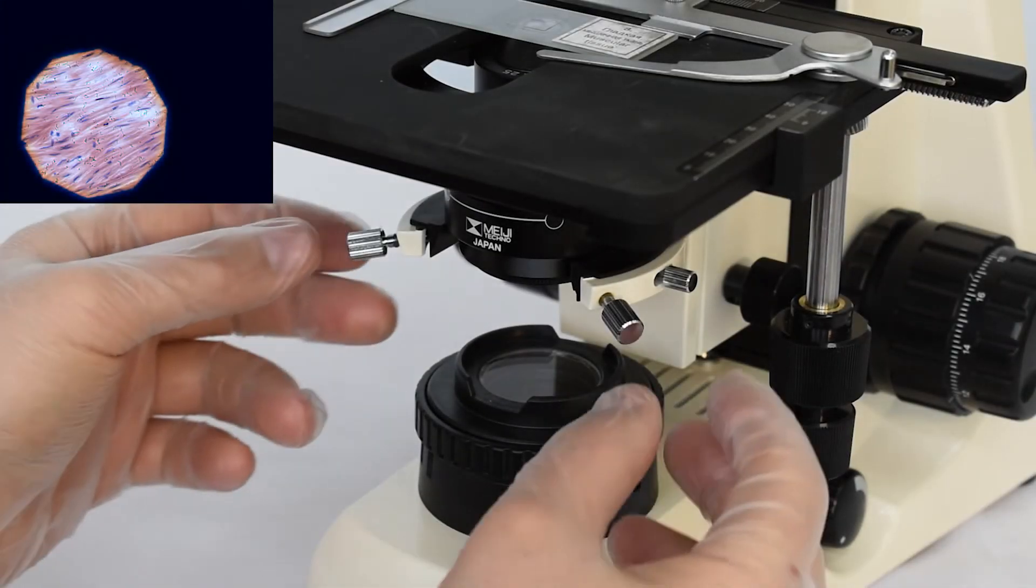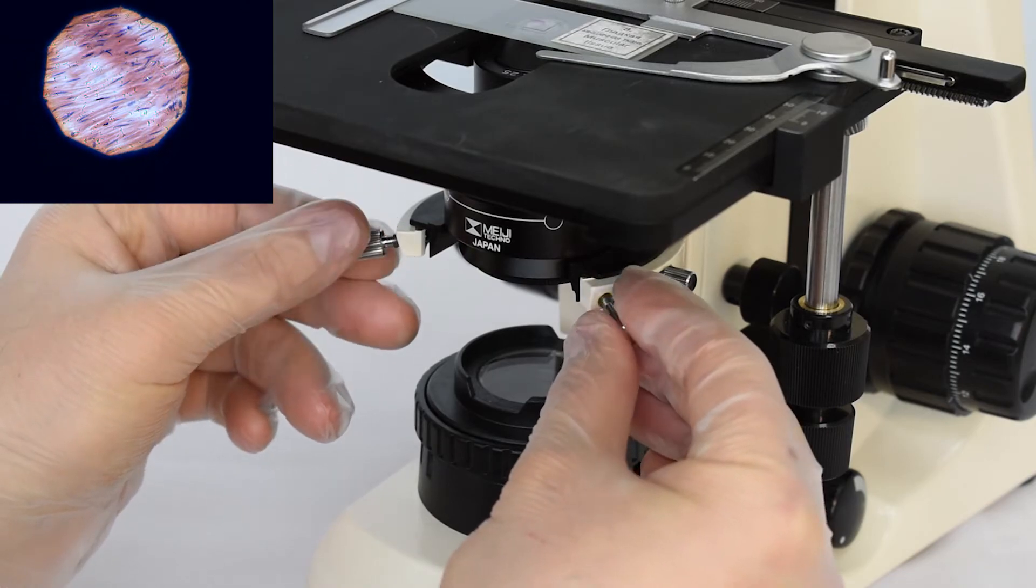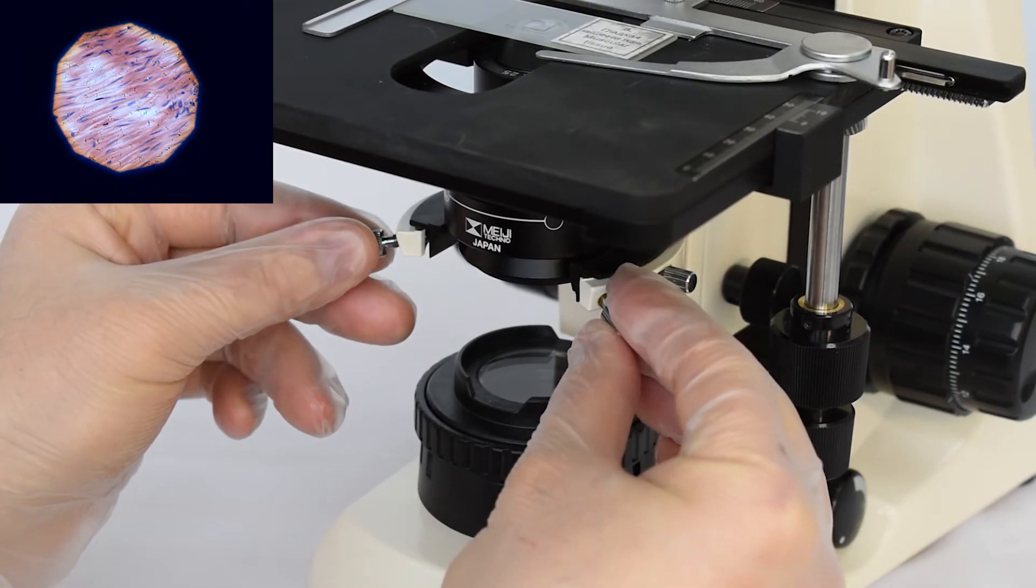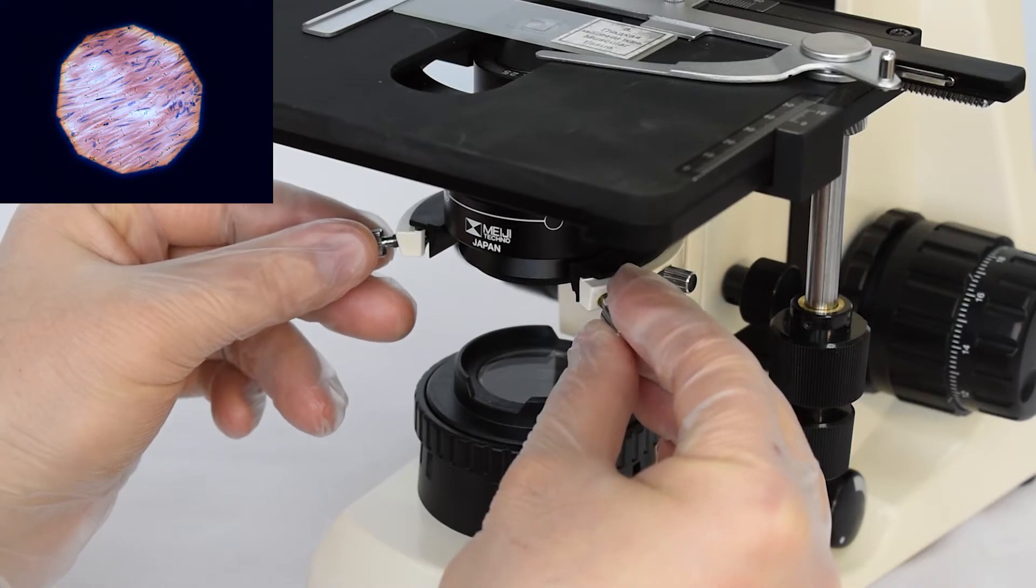Condenser is centered using two screws. Turning these screws place the polyhedron of the field diaphragm in the center of the field of view.